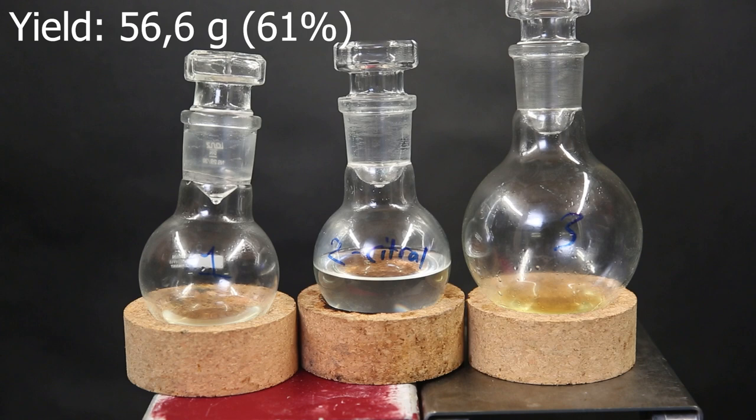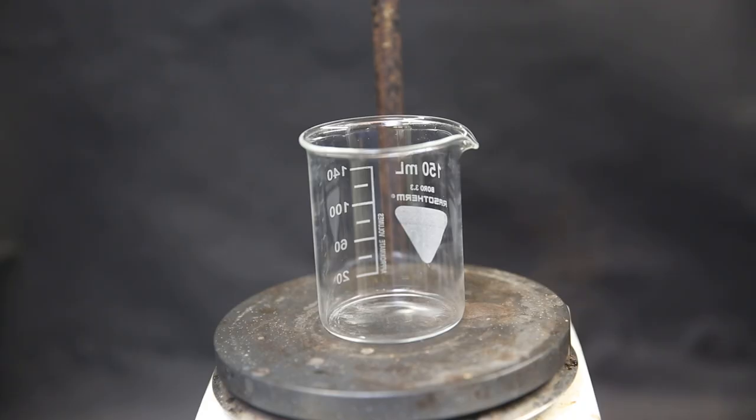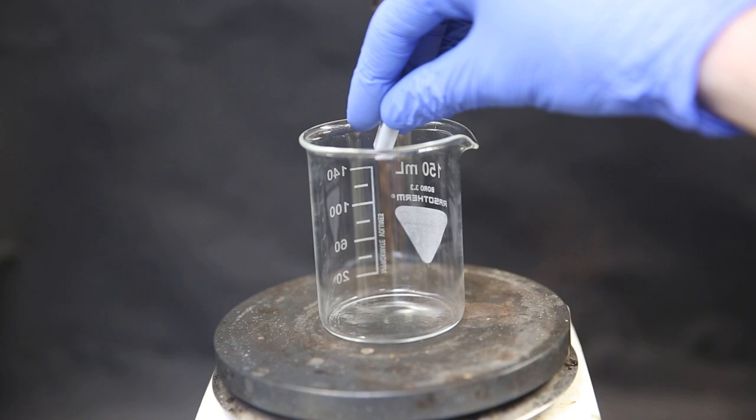But before that, I will prepare some solutions. So I set up a beaker with a stir bar and add in 55 mils of absolute ethanol. Then I add in 2.54g of sodium metal. This will react with the ethanol and make a solution of sodium ethoxide.